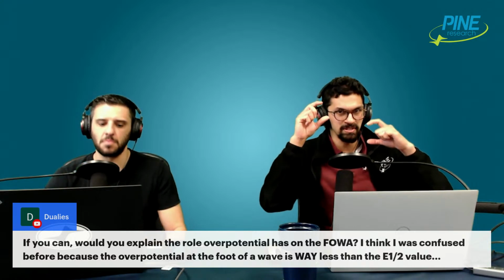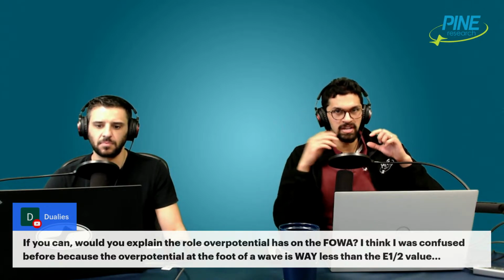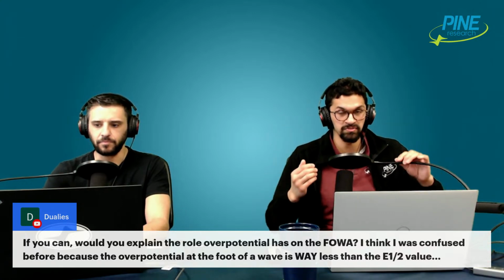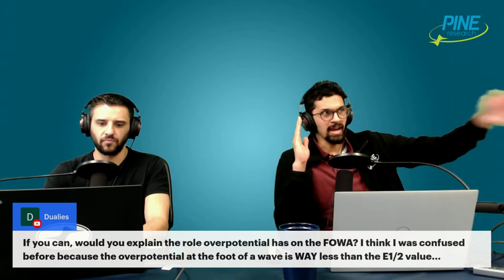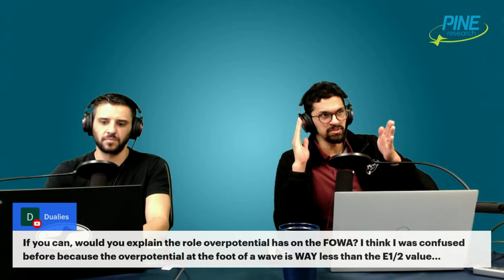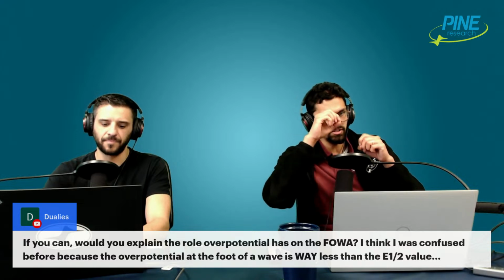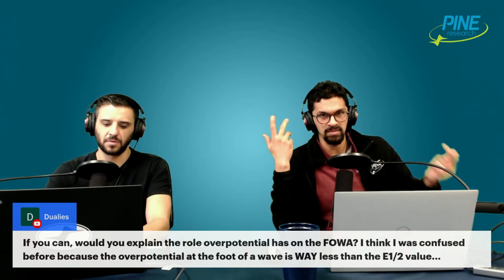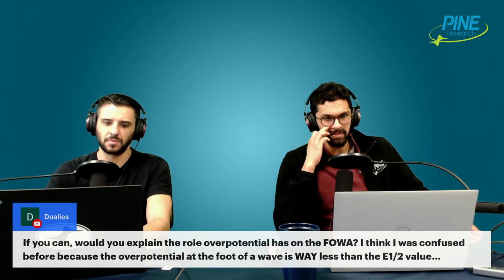Because it's at equilibrium and the kinetics are fast, you establish equilibrium very quickly. Whenever the potential changes, there's going to be a change in the ratio of concentrations. That's going to result in a current flow. So even if you're away from the E0 of the reaction, which still has some value where at equilibrium this needs to be the ratio of the concentrations, if I'm at this point, I am no longer at that correct ratio. Current flows, it corrects the ratio. And then as you keep moving, it keeps correcting. And that is why you see current flow.